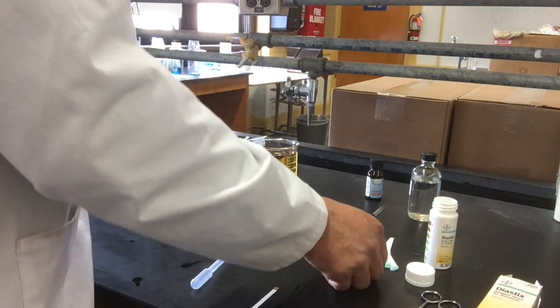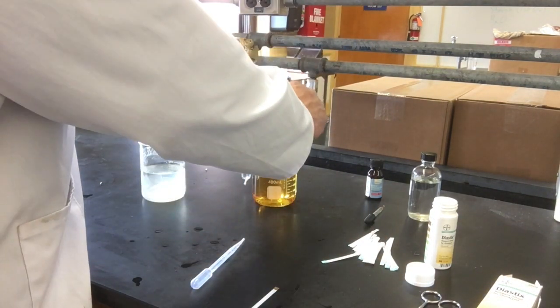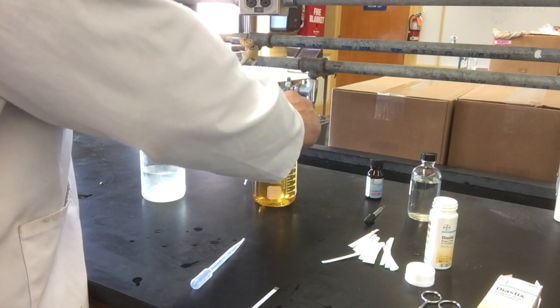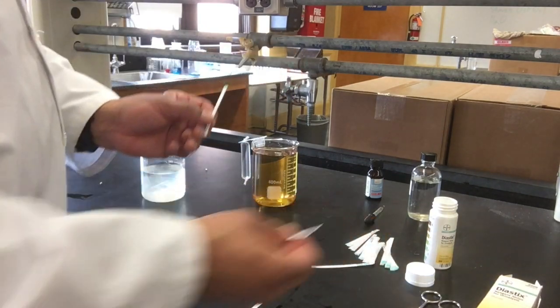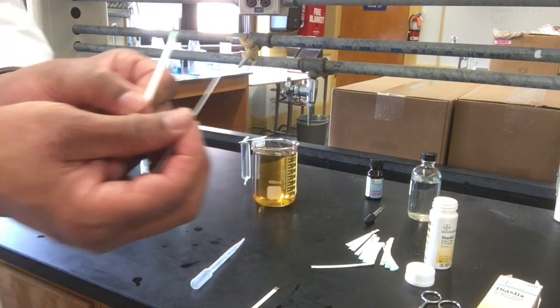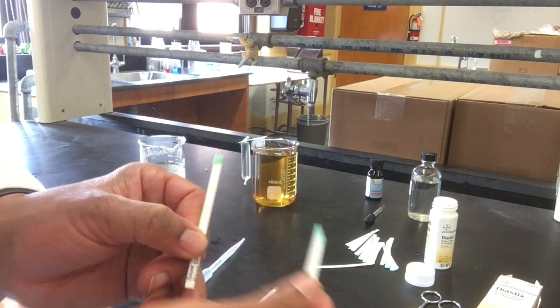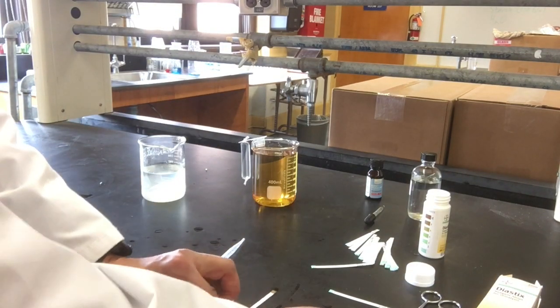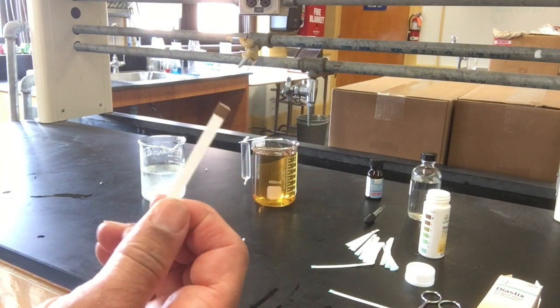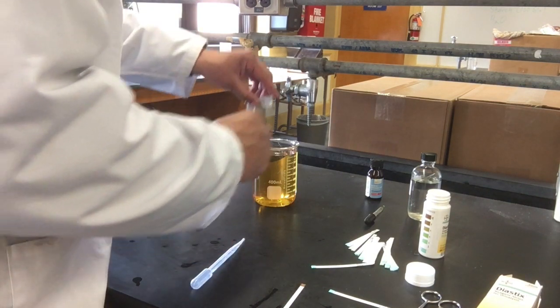Since I'm interested in glucose, starch, and iodine, I'll test the beaker with my dye stick. Looking at the color change, I don't see much change. Comparing to what was in the bag—this nice dark brown color—the bag has glucose present, but the beaker does not.